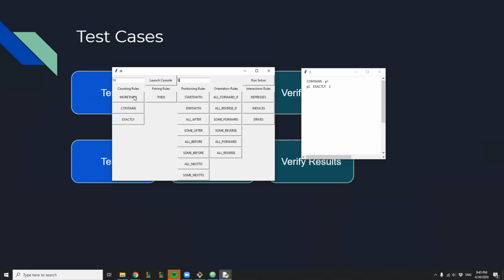And these sequences will have more than one P3 part in each of the sequences. And we have P2: some of the P2 comes before P3.